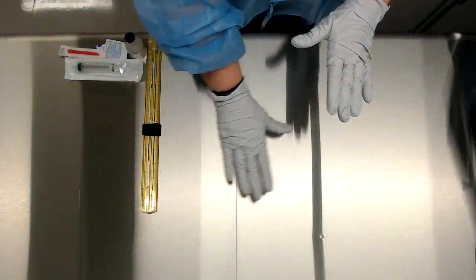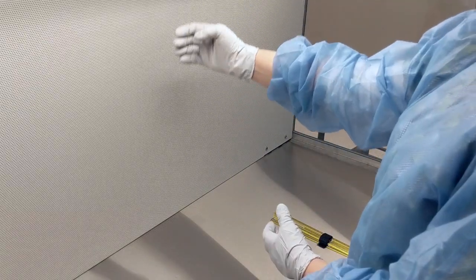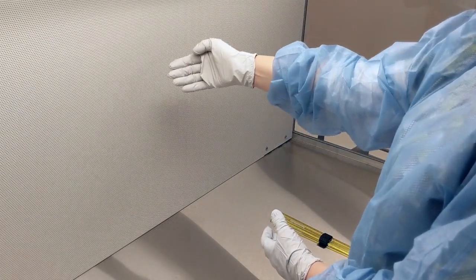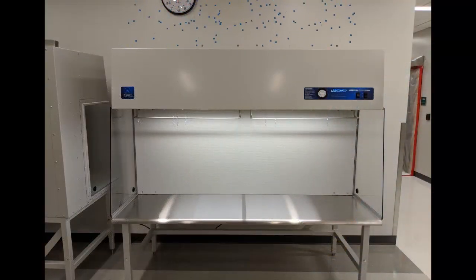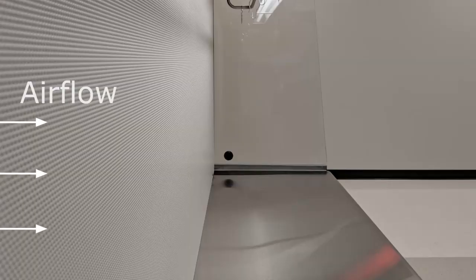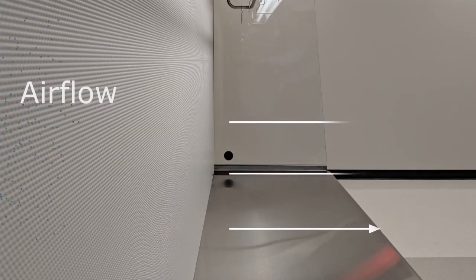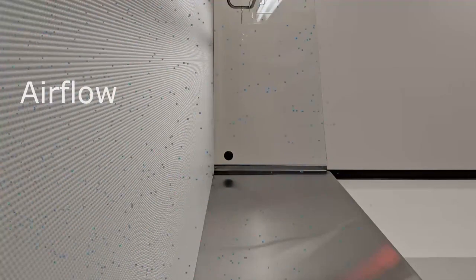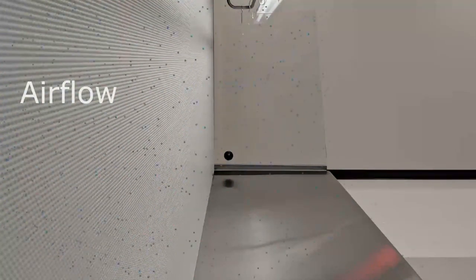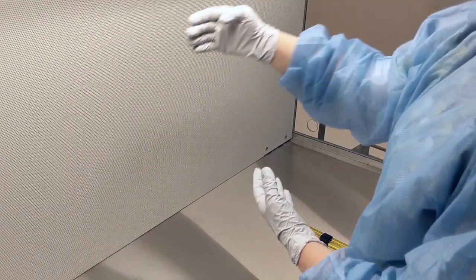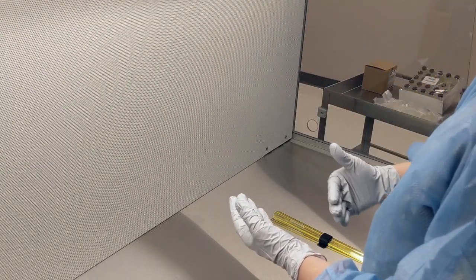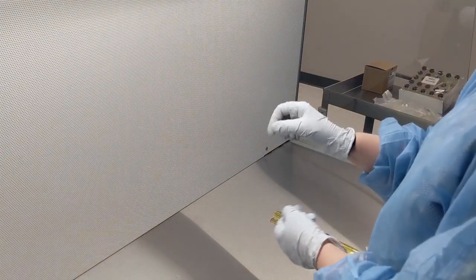What we have here is the base of the table and a screen. Behind the screen is a HEPA filter that filters the air in the room and circulates it out horizontally towards you. The air comes towards you, gets sucked up into the back of the filter, and comes to you again, continuously circulating. This keeps the air flowing so there's no particles or microbial contaminants in this space.